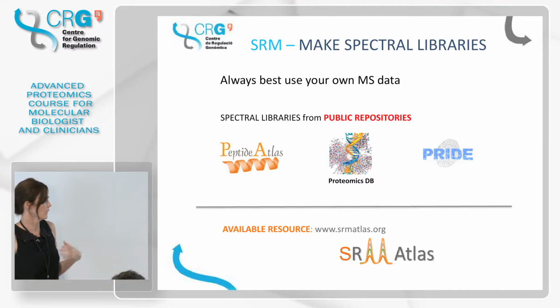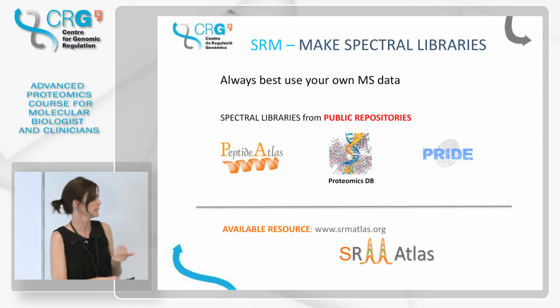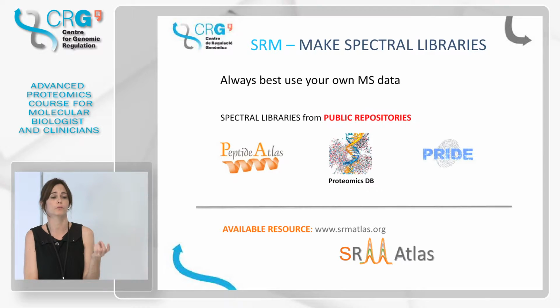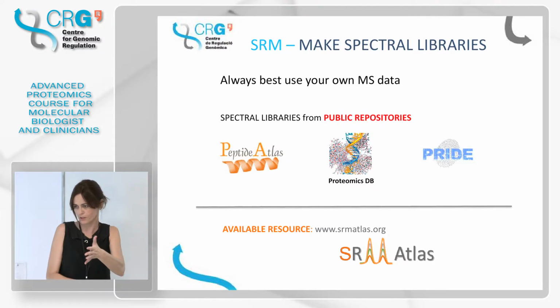So again, it's always best to use your own mass spectrometry data, but you can check in the public repositories. There is also SRM Atlas, which is a repository where you can see SRM assays and SRM measures. So that's also a good source of information: the peptides of one protein that have been monitored by SRM were chosen for a reason. So those are good candidates.